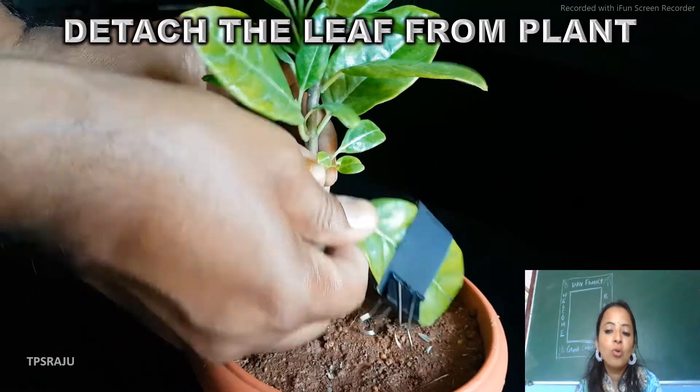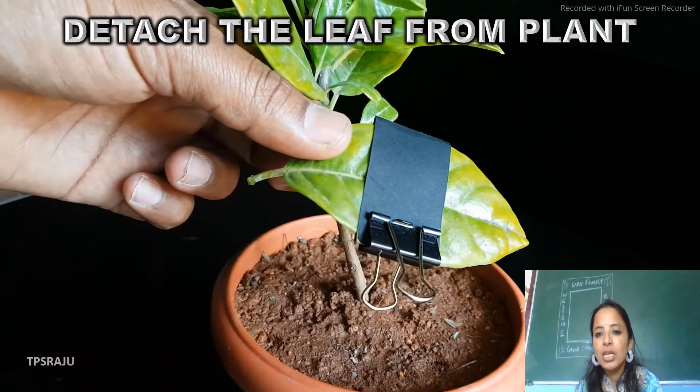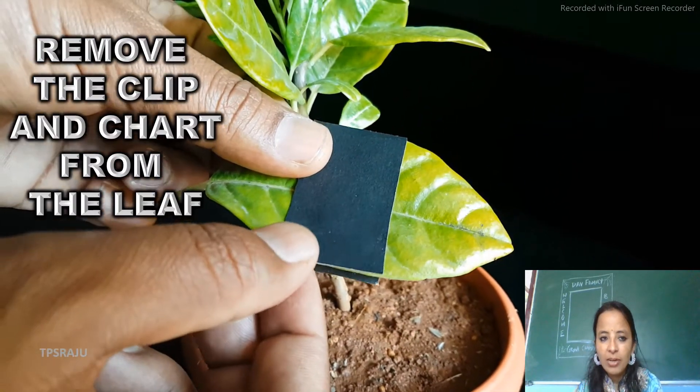For this we are supposed to do one test. We will detach the leaf from the plant and then we are supposed to remove the clip and black chart from the leaf.